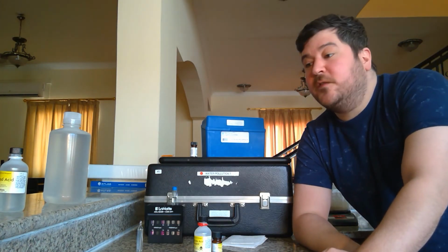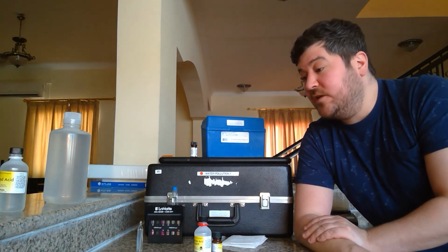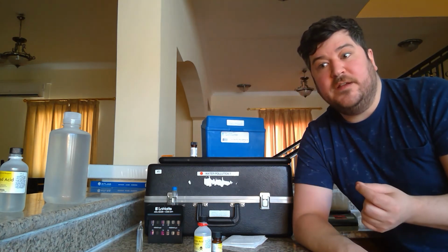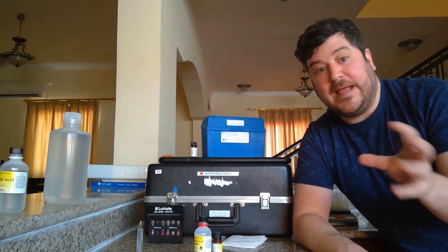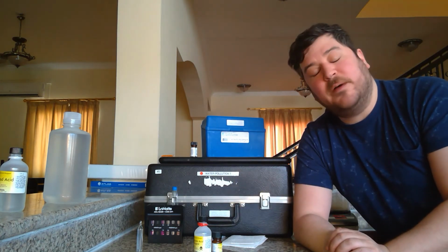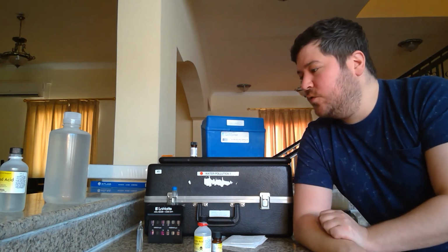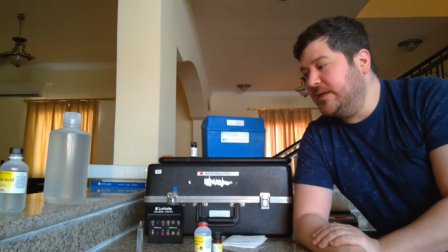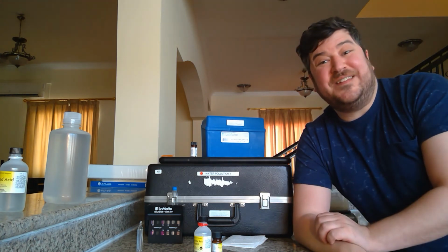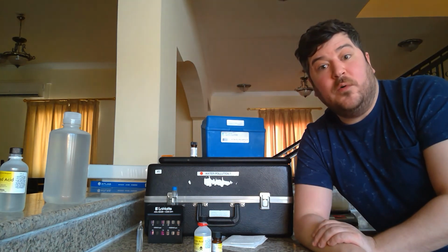Well, so that's it for the experiment. The procedure for the phosphates test doesn't mention multiplying it by any numbers. So our results for the nitrate test, all of this will be in your lab quiz, but it was 0.2 ppm on the reader, which we then multiplied by 4.4. The phosphate test was less than 0.2 ppm, so 0 to 0.2 ppm, and we don't have to multiply that by anything. This is a test specifically for orthophosphates. So that is the results that we're going with.